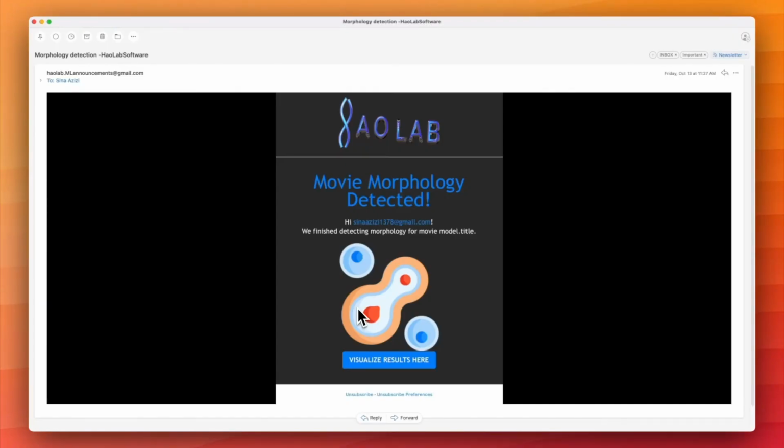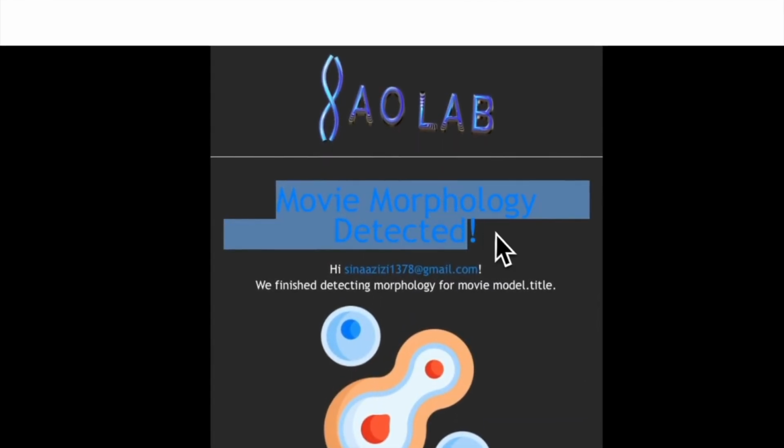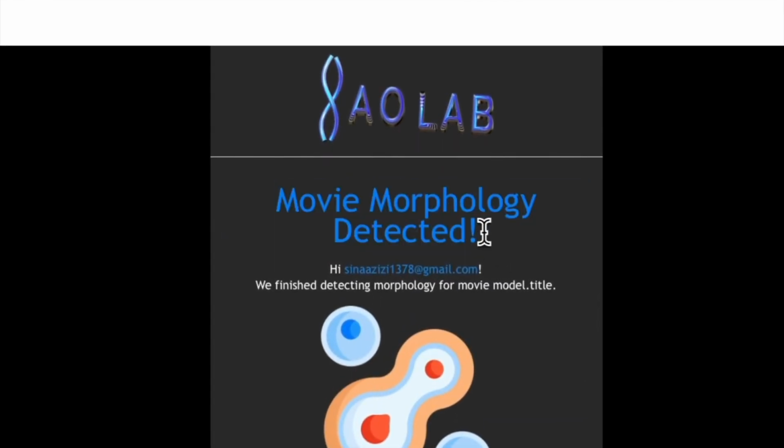So once the mother cell is indicated that it has washed or died out, it means that the movie is finalized, its tracking is finalized, and you will receive this email saying that the morphology has been detected, and we're going to start processing it.